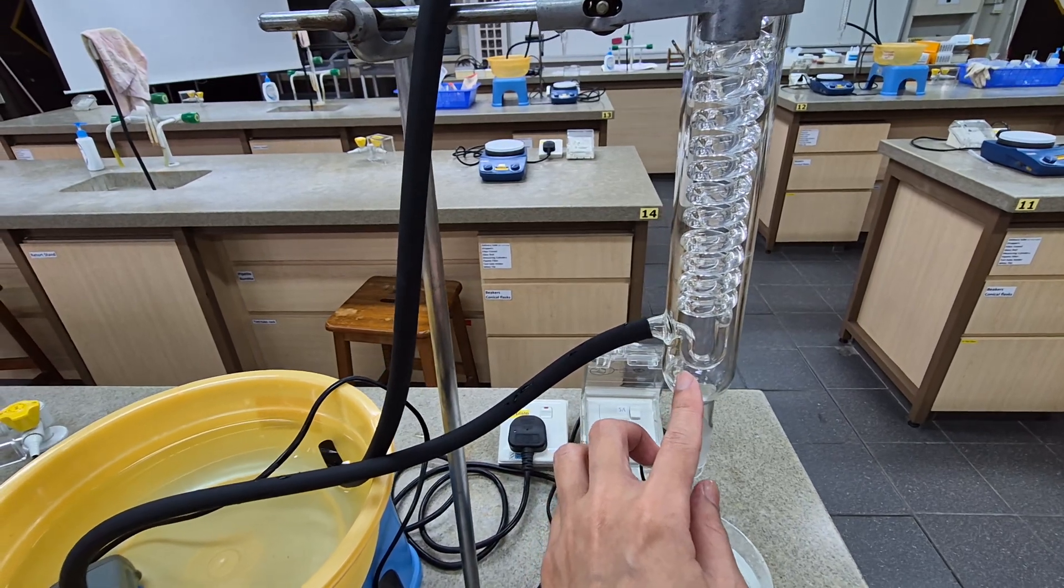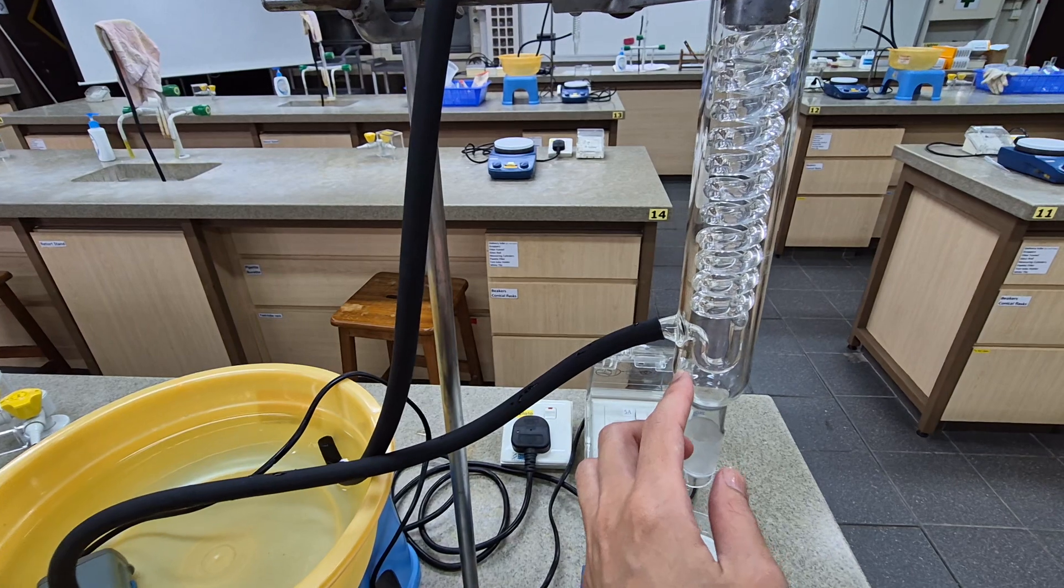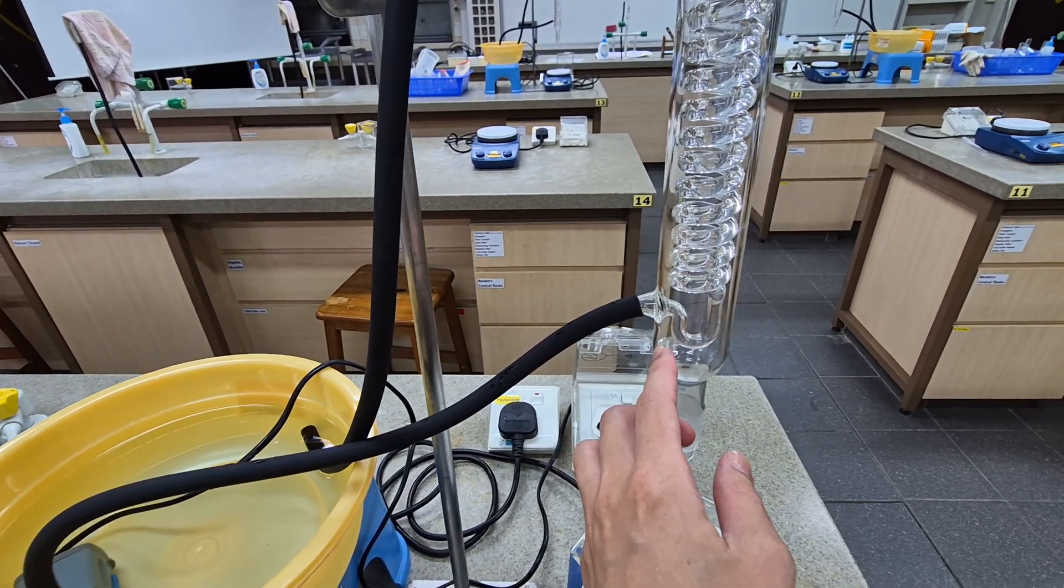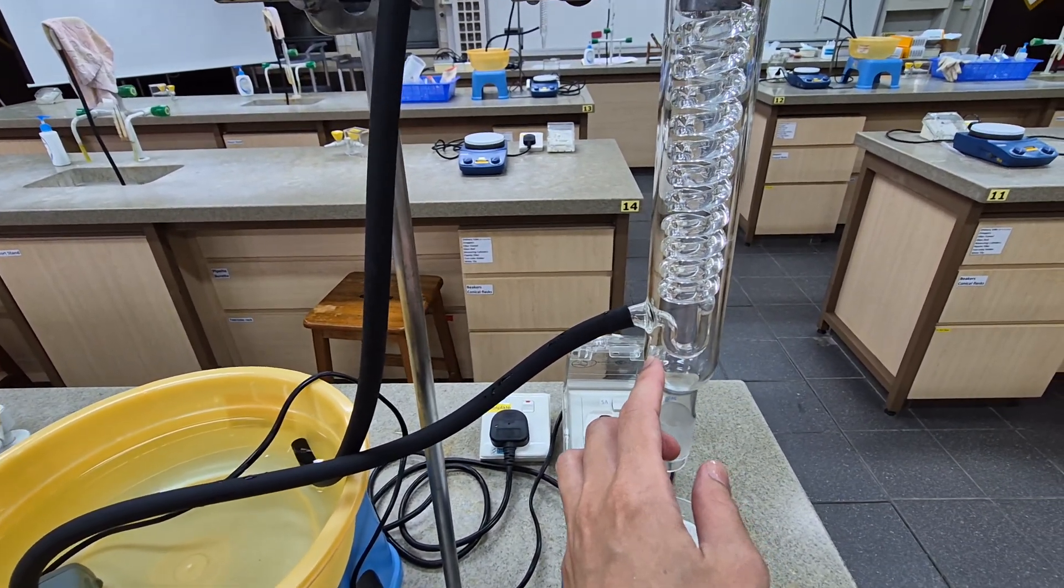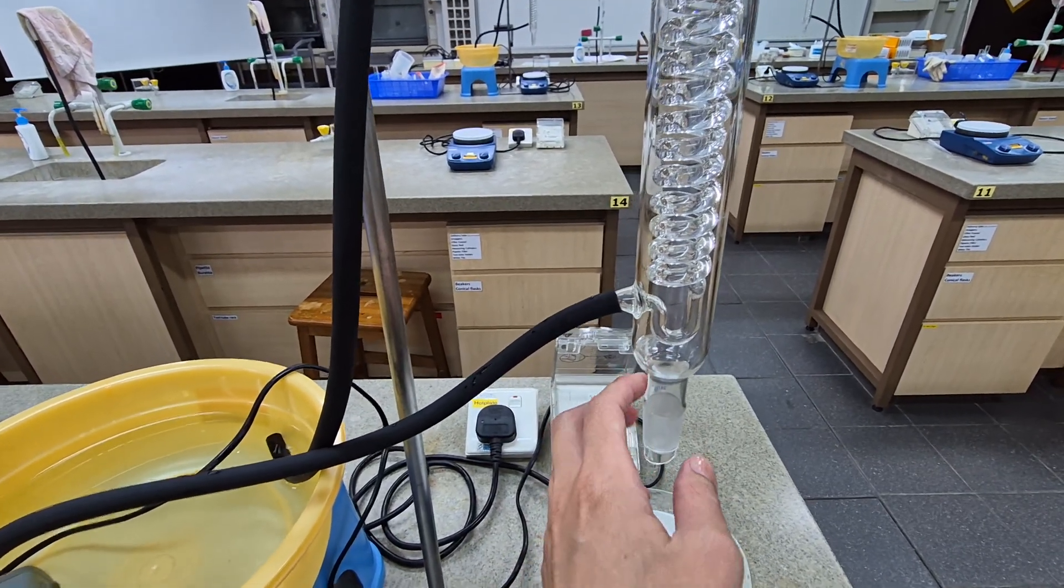This way they will be condensed back into the round bottom flask. So later on when the round bottom flask is set up below, you will be able to see how the reflux takes place.